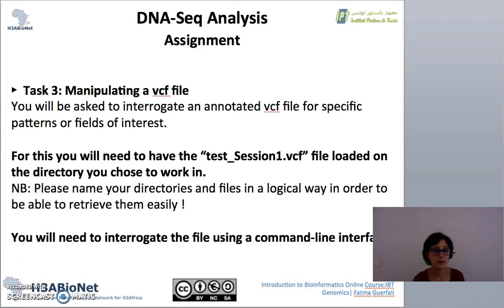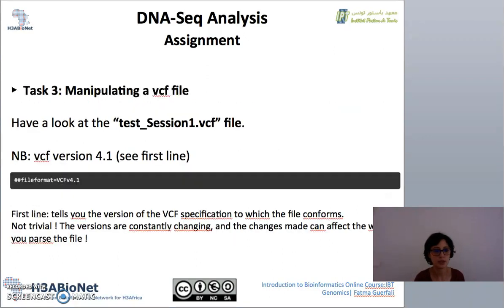So a .sam file, you know what is in it. A .bam file, you know what is in it because it has that .sam or .bam extension. If you sort it, you would name it .sorted.bam, for example, etc. And we will see how to use the command line to interrogate this file.